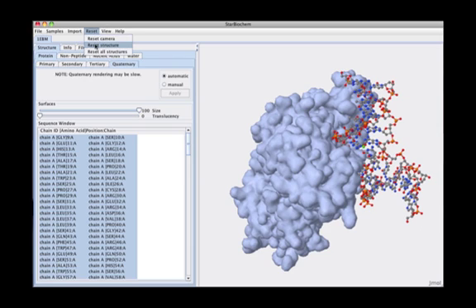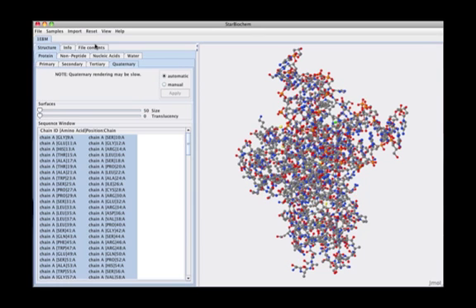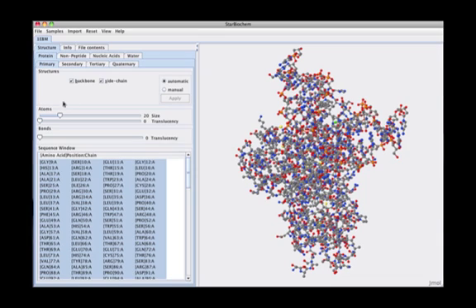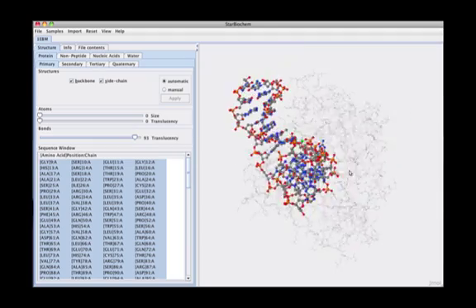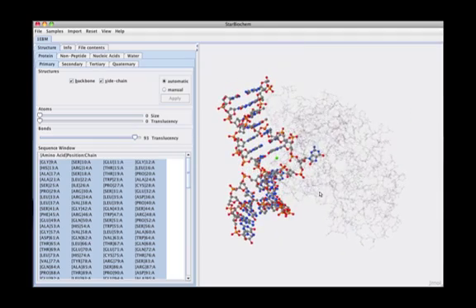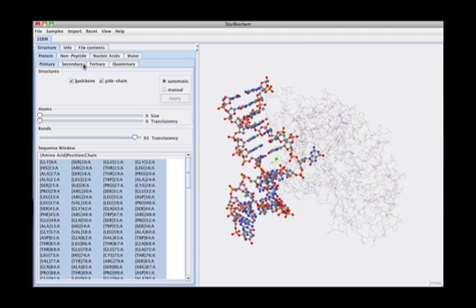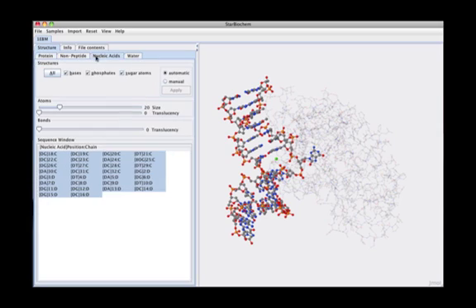Some structures contain other molecules in addition to proteins, such as non-peptides, nucleic acids, or water molecules. The ability to easily obscure and highlight structures allows students to readily discover structure-function relationships.